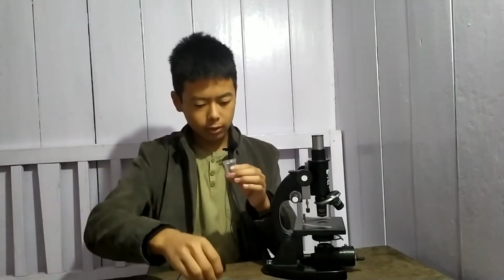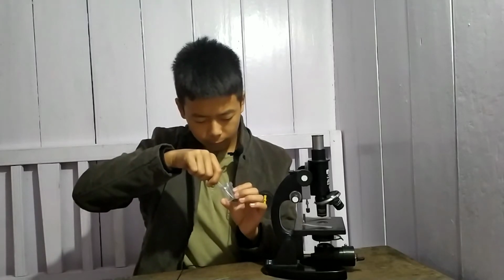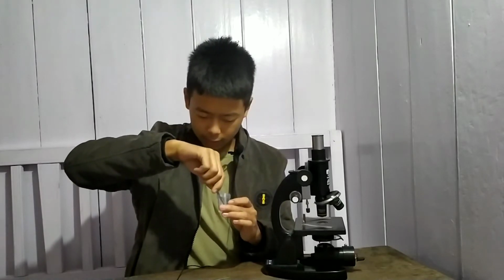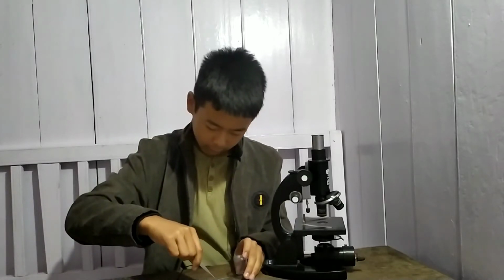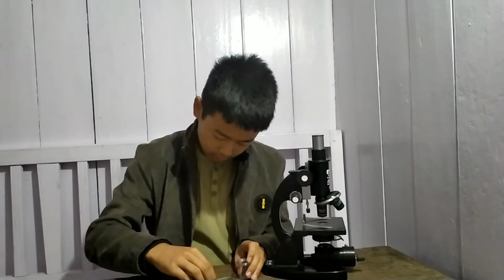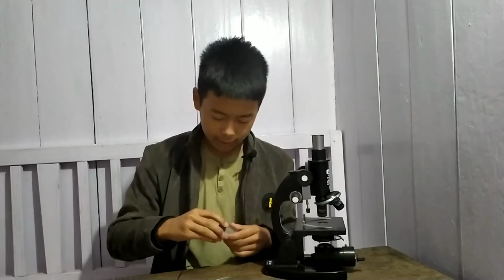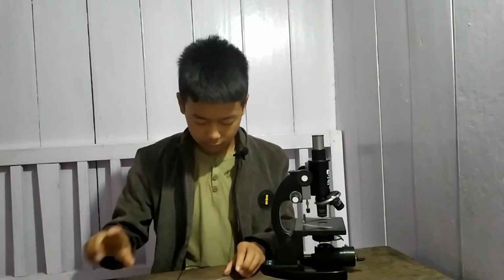So I'm going to open this container. Actually this is a container of my microscope lens. So I'm going to open it. There are two fleas, so I have to be careful because they can jump. Yes, they can jump with very powerful strength. They can jump 100 times farther than their size, maybe 3 to 6 inches. They can jump up to 3 to 6 inches.